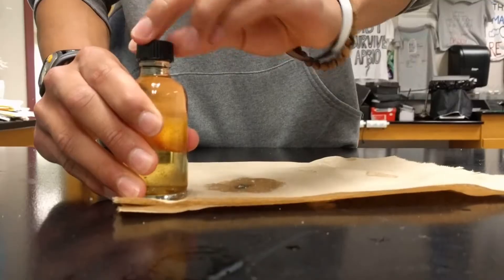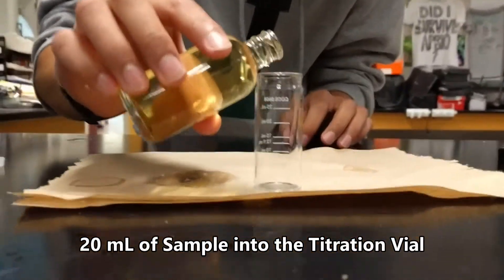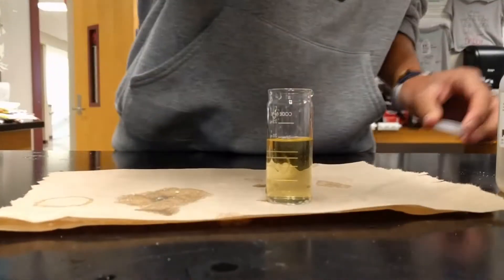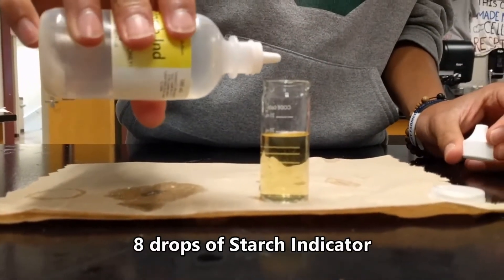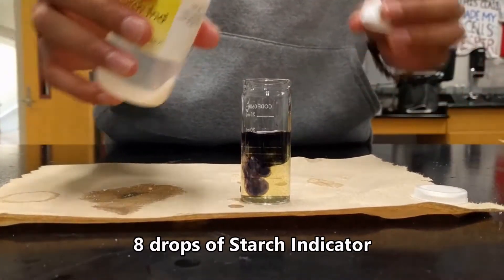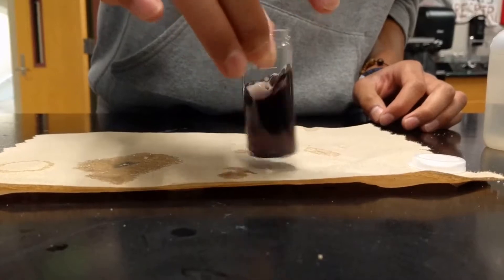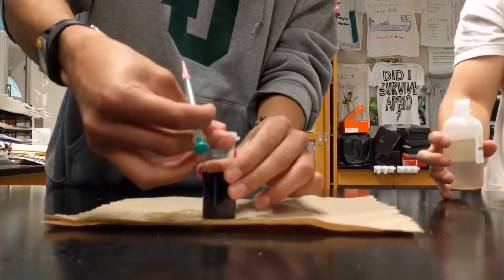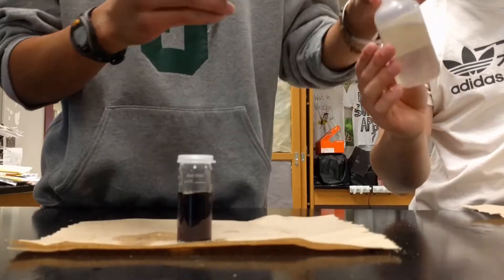So now we are going to add 20 ml to a titration vial. To the titration vial we are going to add 8 drops of starch indicator and we will swirl it. So now we have a purple-black solution.